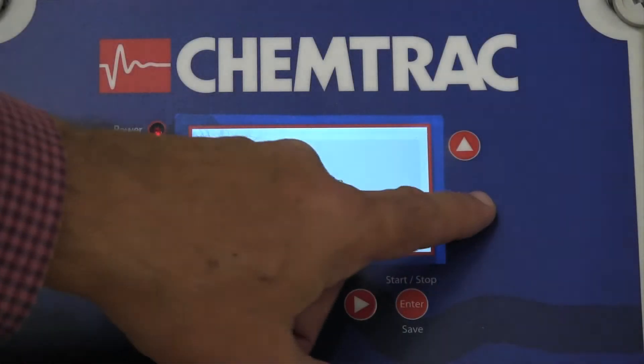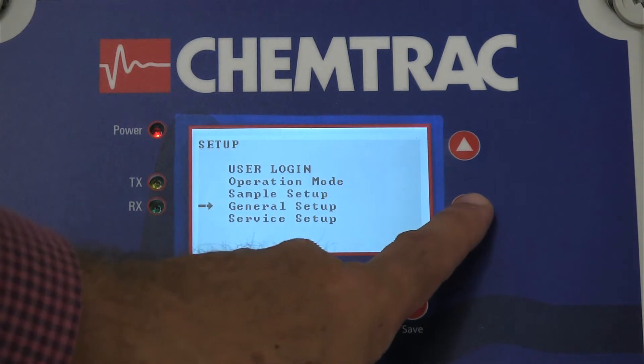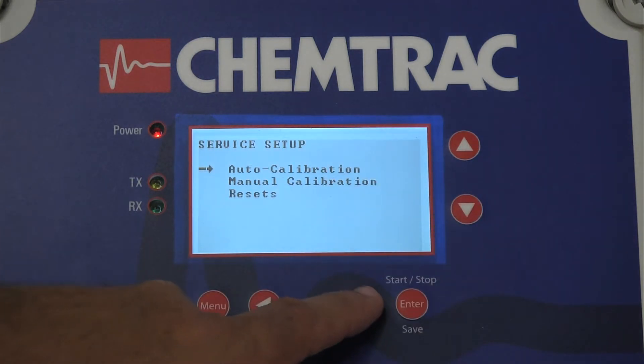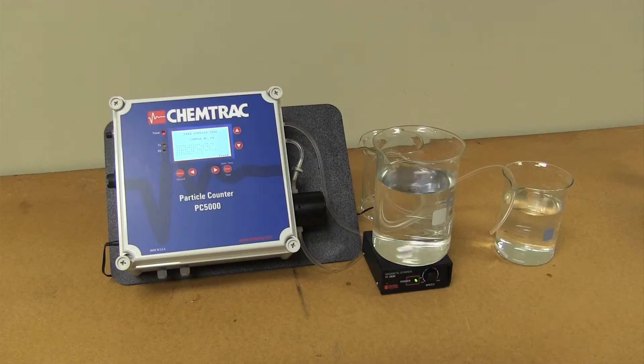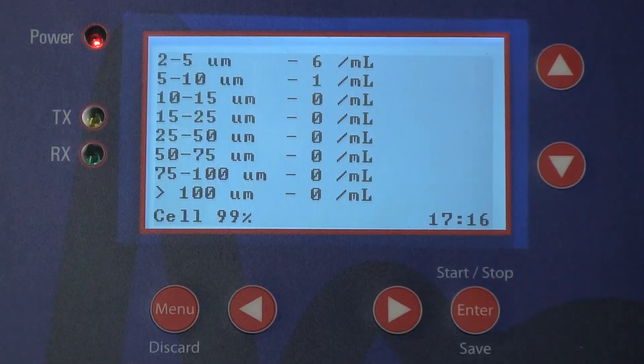The automatic calibration mode can be reached in the menu. The standards must be diluted into appropriate concentrations. Clean beakers and particle-free water are required. The quality of the dilution water can be checked to determine the degree of any present particulate.